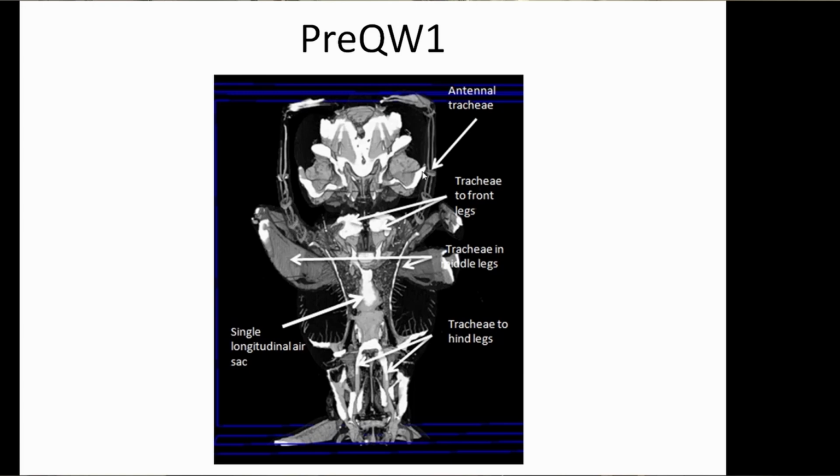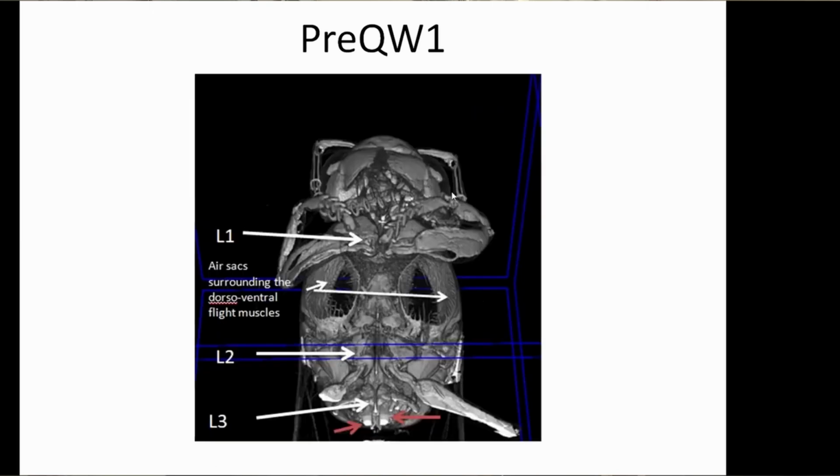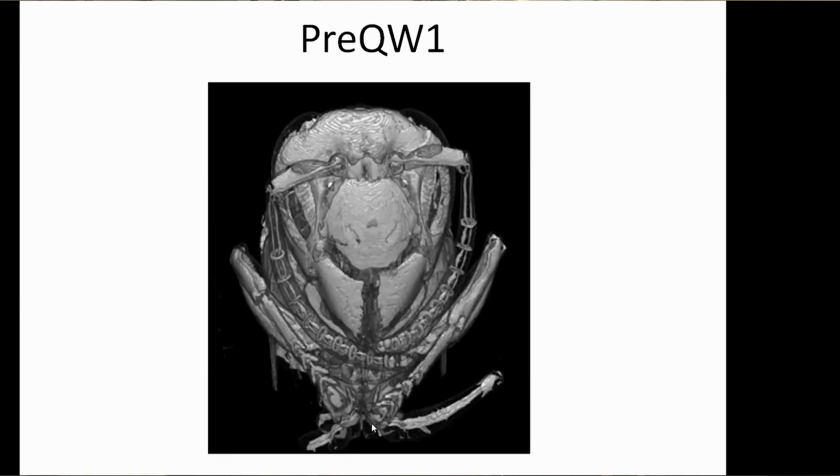These little round rings are artifacts. Here now the trachea going into the legs. You can also see the petiolar ones. These are the ones going through the wasp's waist. We've already seen it from the other side, from the abdomen, and these are the all-important spiracles connecting the air supply of the thorax and head to that of the abdomen.